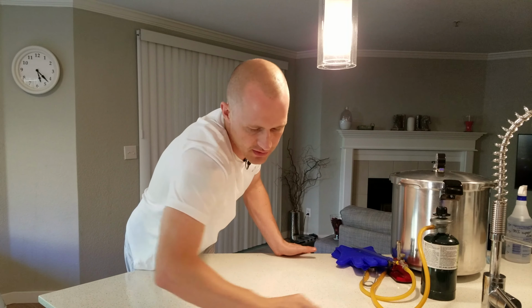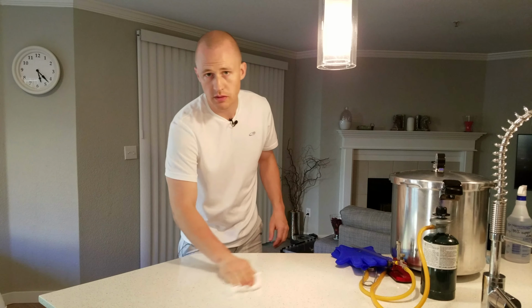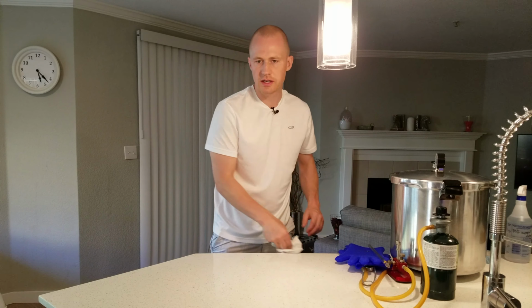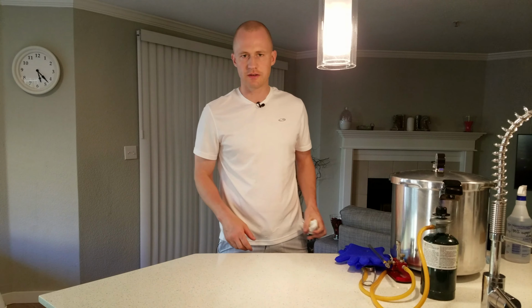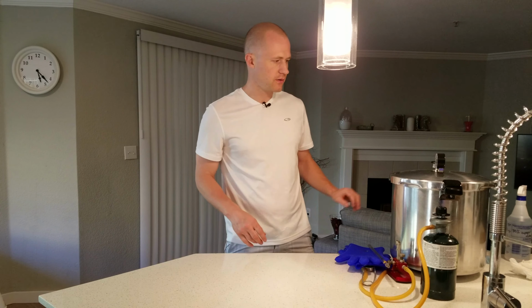If you have a hairnet, wear that. If you have an apron, then put that on. And if you have AC, turn it off. Close all the windows. You don't want any drafts. So that way, the only draft you create is the one that comes from the Bunsen burner. So we have that clear now.